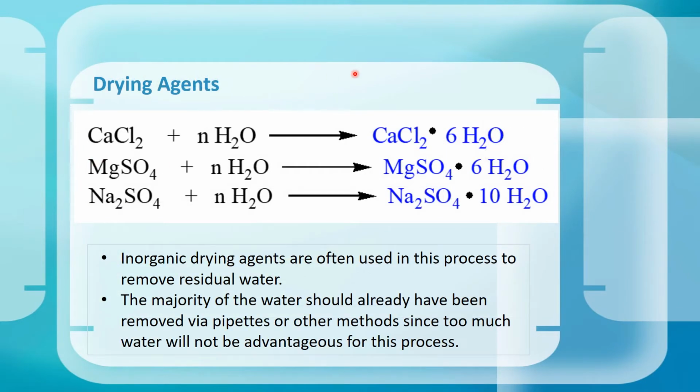Now, as far as the organic phase is concerned, the organic phase that remains generally has to be dried. So once you put some water into it, there's a good chance you'll have a little bit of water in your solvent, because remember, everything has a solubility. And even though water and organic phases don't normally dissolve in one another, they do dissolve just a tiny bit. And that also changes based on temperature and other things. So you have to take that into account.